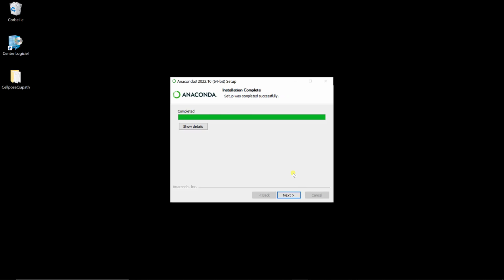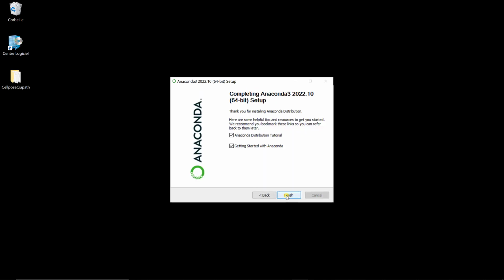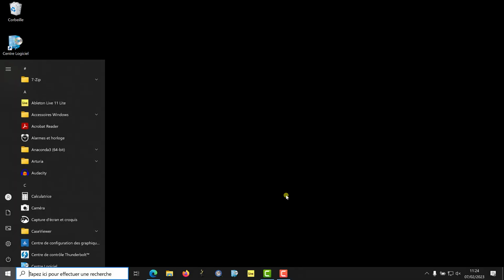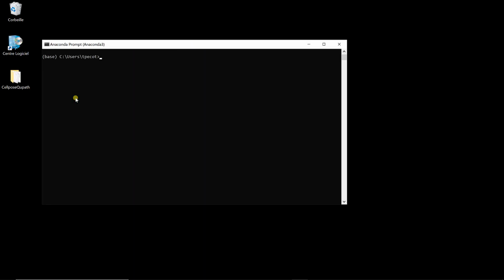Alright, it's done, so it's a bit misleading. It goes very fast up to almost the end and it takes a little bit of time, but that shouldn't be too long. So now I can just go next and finish, and I don't want to have a tutorial or anything. I'm just going to finish it. Now that it is installed, if you type in the launching bar Anaconda, you should have something which is called Anaconda Prompt, Anaconda 3. So we're going to open this prompt and we're going to install Cellpose from there.